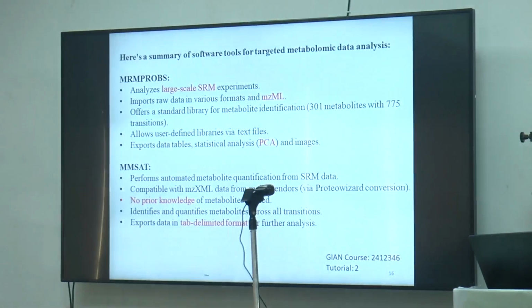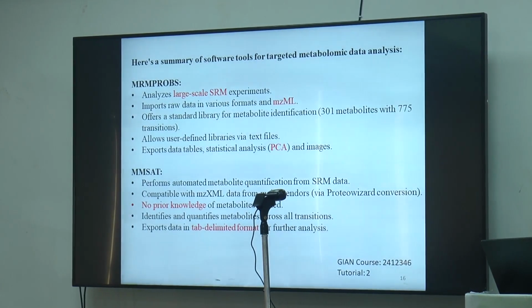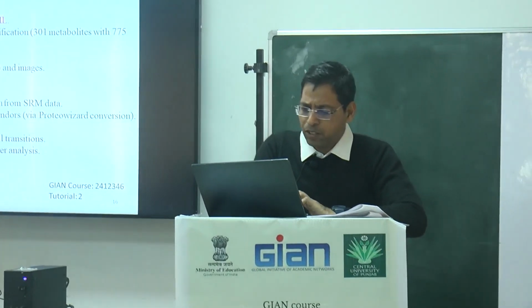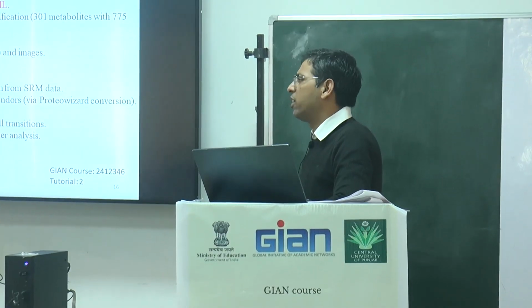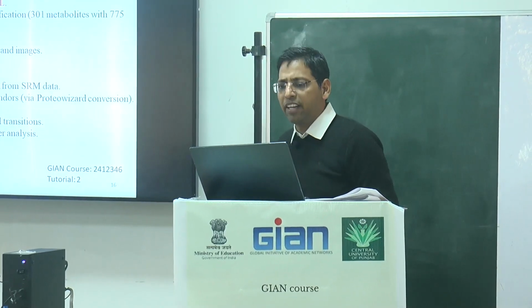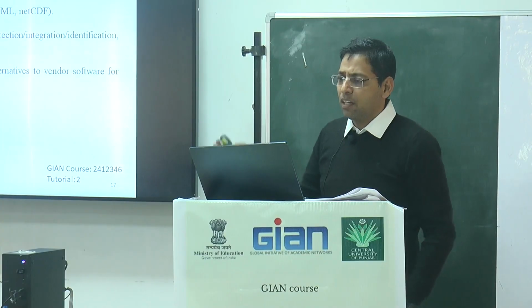This is compatible with mzXML files, and yes, many software are available which are provided by different vendors. You don't need prior knowledge for this type of experiment, and you can identify and quantify different metabolites coming from different biochemical shifts also, and yes, export data in tab-delimited format for further analysis. So this is the open software.